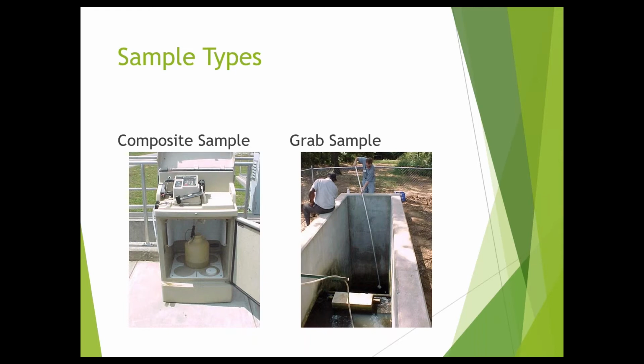That's one time. And this is why when you go out to your effluent and you have to take a sample for fecal and you have to take a sample for TSS and you have to take a sample for all these other things, they all have the same time on the jar because you're doing them all within 15 minutes.